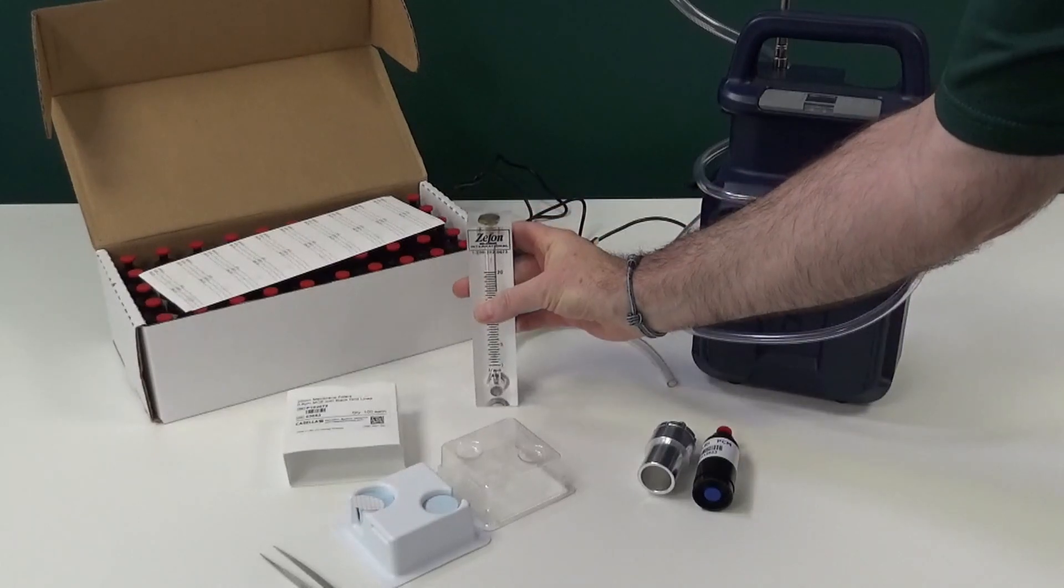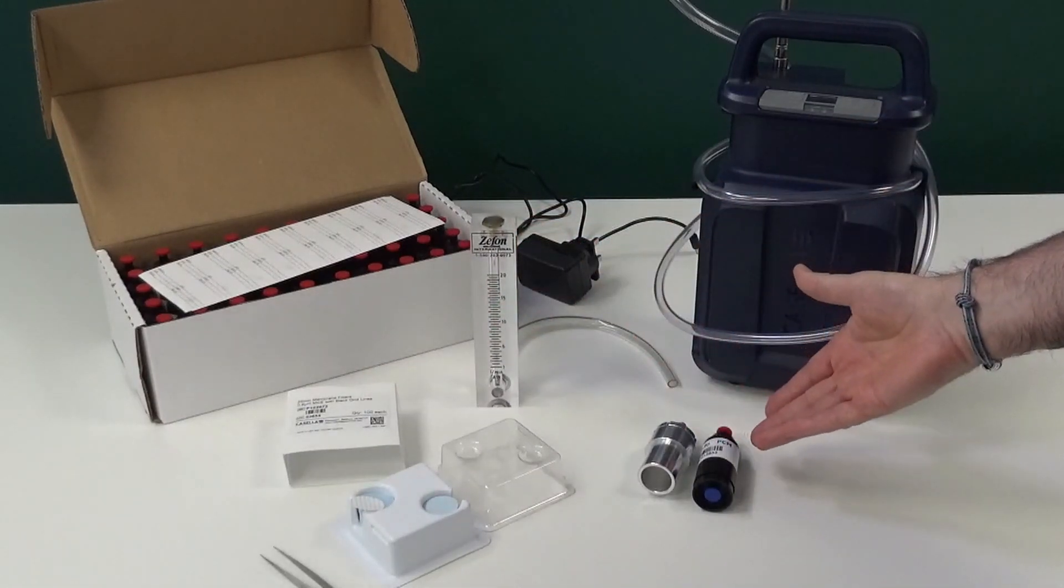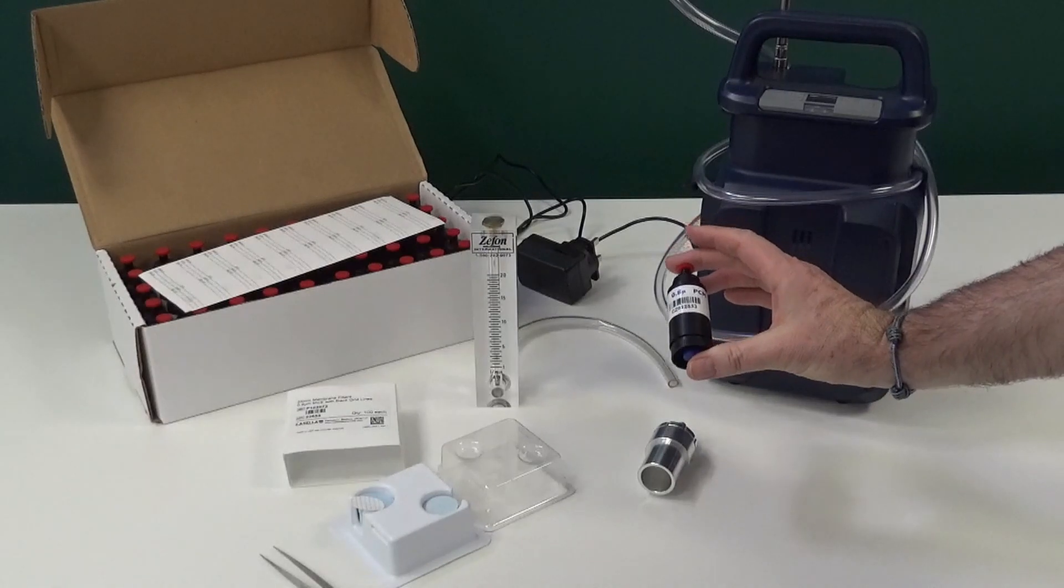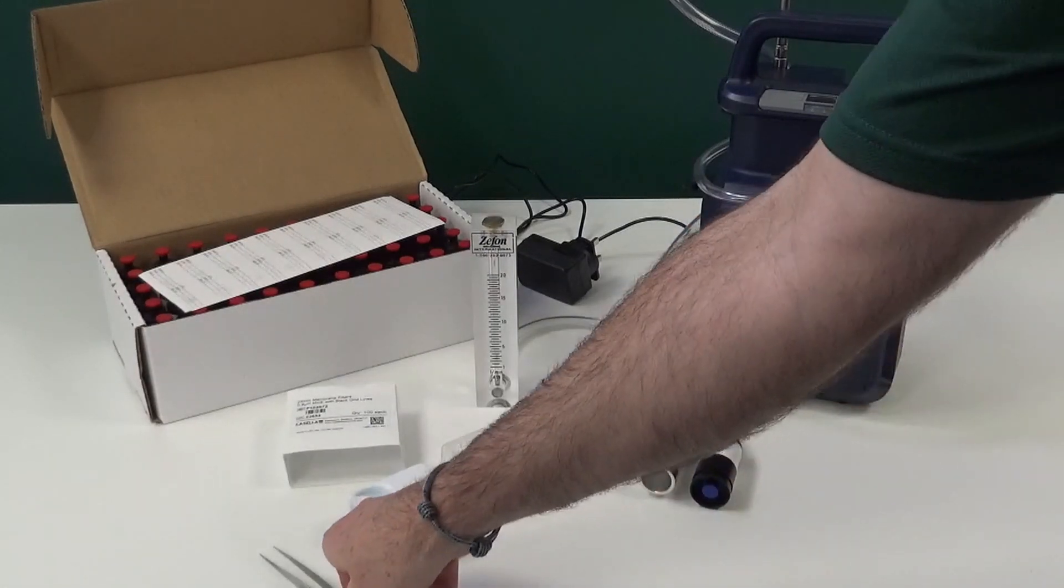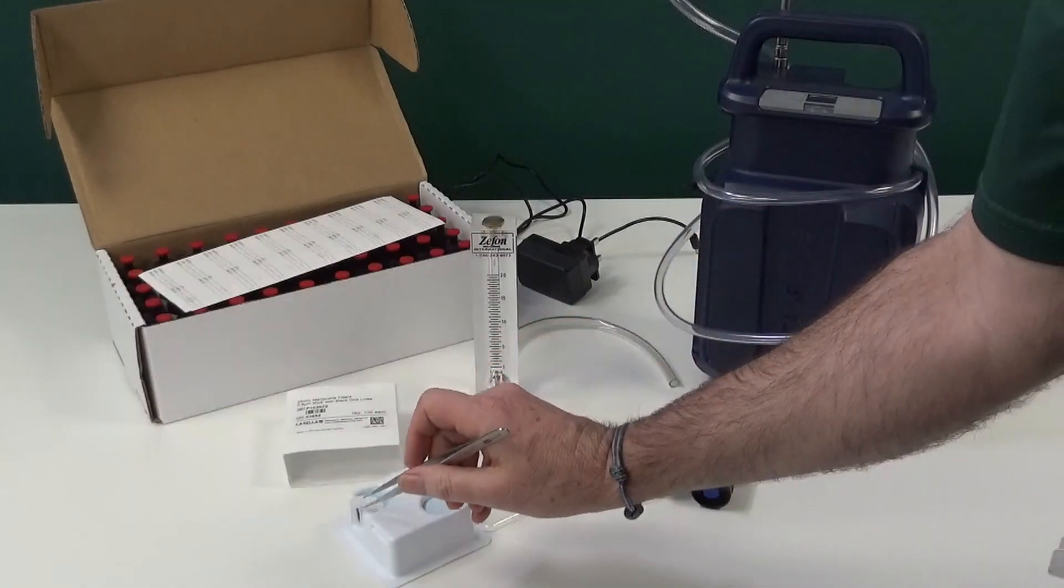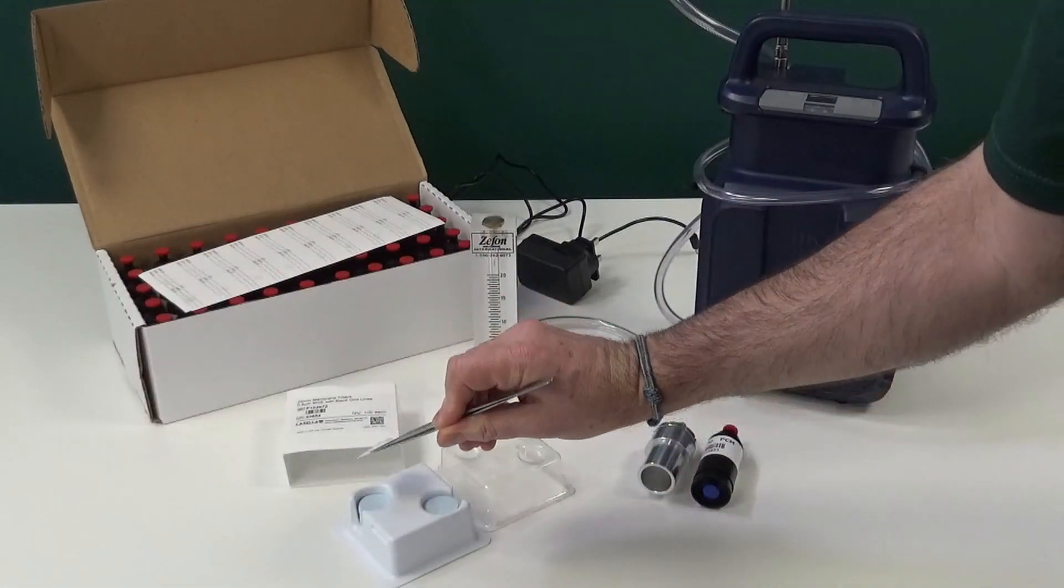There are various sampling heads available. Today we are going to use the asbestos sampling head. Some sampling heads can be purchased with preloaded filters. Finally, if you are loading the filters yourself, you will need filters and tweezers to handle the filters.